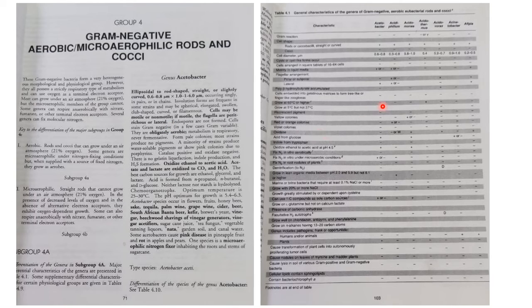Now you can see a whole table is given here with different biochemical tests. Not just biochemical tests, starting from the cell shape, gram staining, to the cell diameter, everything is mentioned in this one particular table.